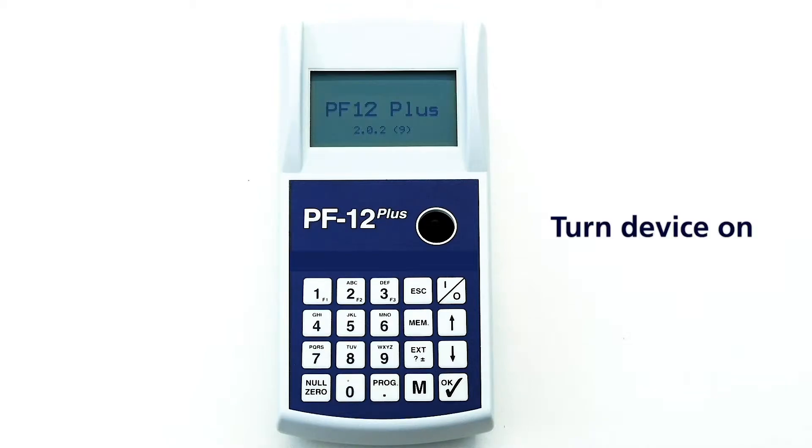First of all, turn device on. Make sure you have enough battery to complete the whole process.